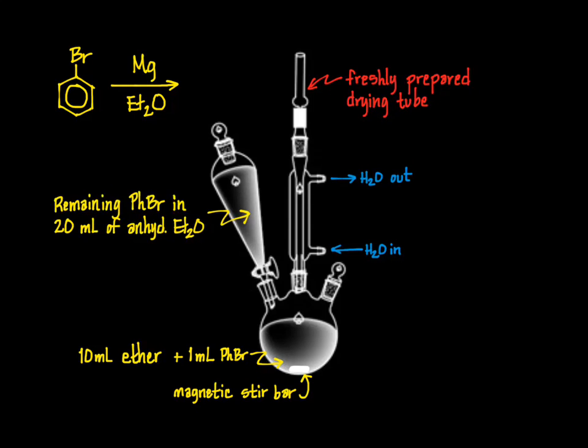The final step in starting the reaction is to add the magnesium. We'll be using magnesium turnings, small flakes of magnesium about 2 millimeters in size. One of the problems with this form of magnesium is that the surface is coated with magnesium oxide, because magnesium naturally reacts with oxygen in the atmosphere. In order for the reaction to occur, bromobenzene has to come in contact with fresh, unoxidized magnesium metal. So to ensure that fresh magnesium metal is exposed, you'll lightly crush it in a mortar and pestle, breaking a few of the turnings, and quickly add it to the reaction. Before you crush the magnesium, fit a powder funnel into one neck of the round bottom flask, dump all the magnesium in a small mortar, give it 3 or 4 quick grinds with a pestle, and quickly transfer it into the reaction vessel and stopper the flask.